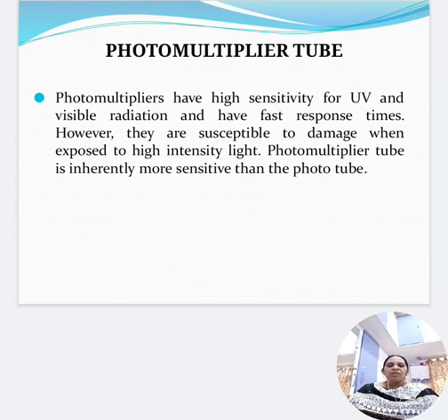The first dynode is coated with compounds like BeO, GaP, or Cs3Sb, cesium antimonide. They eject several electrons when subjected to the impact of a high energy electron. As you have seen in the figure, the dynodes are rounded in shape and converge the electrons to the second dynode. Repeating this electron multiplying process over successive dynodes maintained at higher voltages produces a current avalanche that finally impinges on the anode. Internal current amplification is thereby achieved.